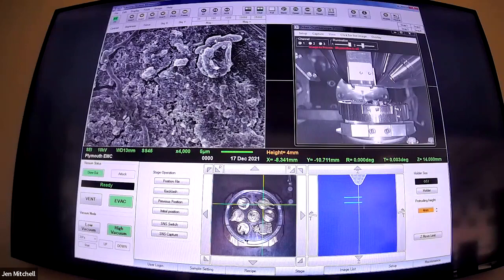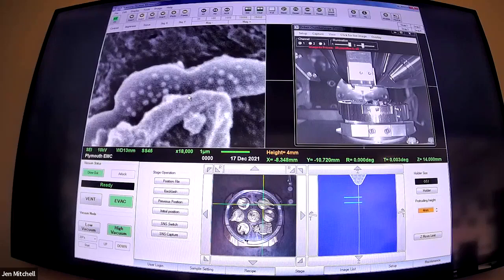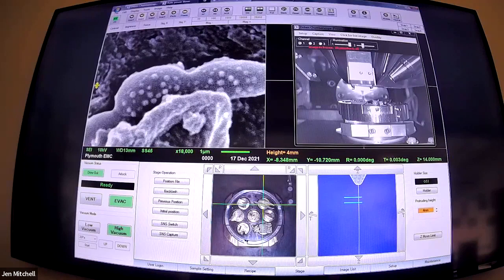There are other analytical techniques that do kind of color. In the first Microscopy Live, you were looking at mapping the elements - you'll have a color scale based on the elements. We also have techniques that can tell you information about which direction crystals in your structure are pointing, and you can use a color scale to indicate that. But you can't directly tell what color anything is - other than maybe if you can tell what elements it's made of, you can sort of reverse engineer it.